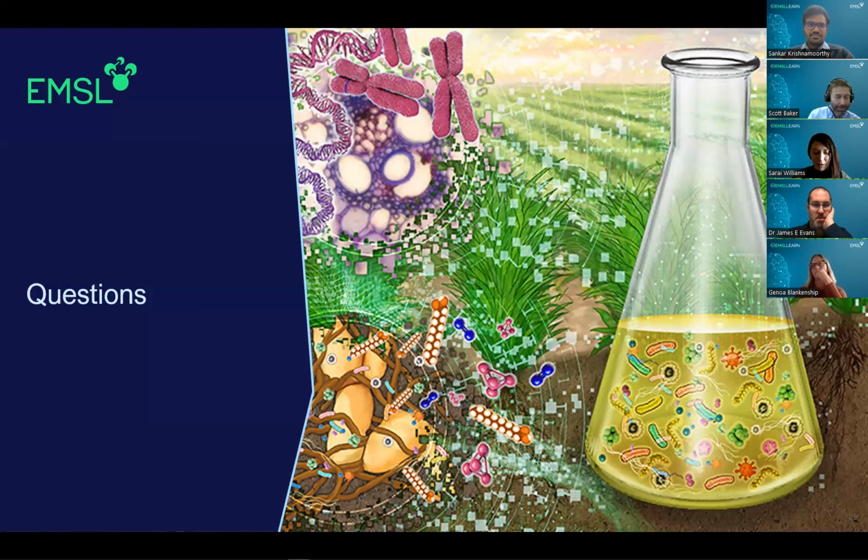Now, if they do not have an LCM, they're welcome to come here and work with Bo Chrysler, or we have other staff that do that, and we could use the LCM to sort the cells with them, and then they can be with us while we are doing the nanoPOTs pipeline.